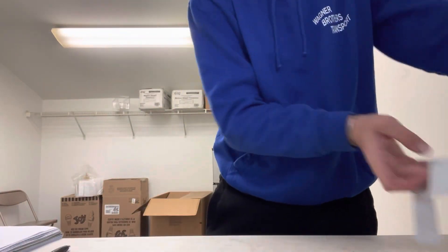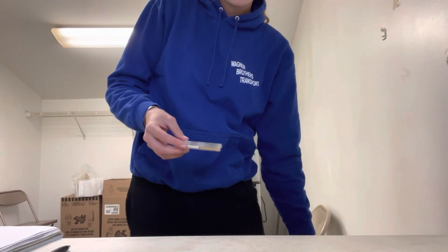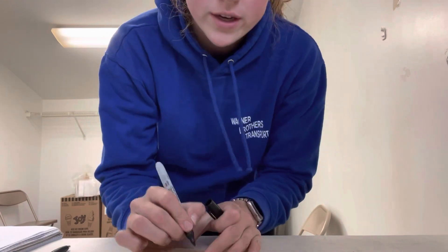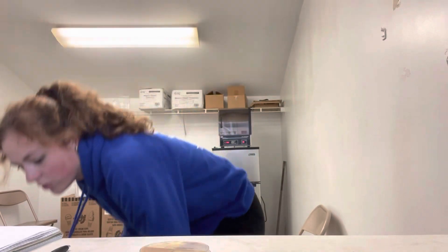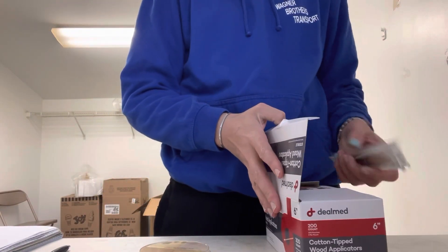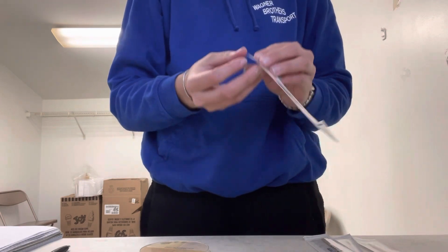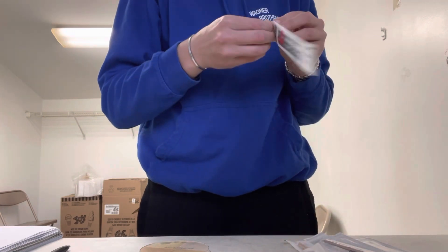So first I take a plate out, shake the excess water off, and I wipe the water off one side of the plate where I'm going to write what number test it is. The number is important so that we know which milk sample we are testing. Then I get out some cotton swabs — they're sterile, so when I take them out of the packaging they cannot touch anything except for the milk and the plate.